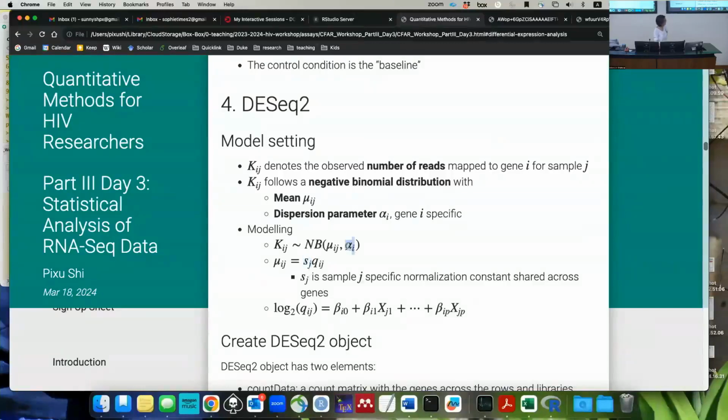And this over-dispersion parameter is going to be gene-specific. The mean expression level is going to be determined by each gene's coefficient and each sample's predictor. So you can see the index i for gene and j for sample both appear in the mean expression. The j for sample only appears for size, and the i for gene only appears for the over-dispersion. This is like you're modeling a really big matrix using all these negative binomial distributions, and it will calculate very efficiently, fortunately, through DESeq.